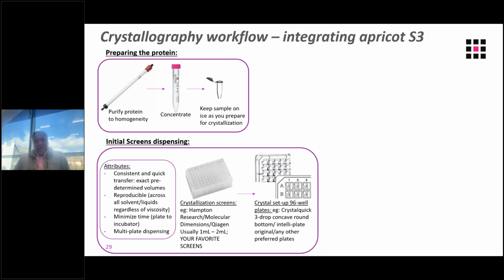And as Dr. Rees alluded to, some of the attributes we want are to make sure that our transfer from these 96 plate screens to the crystal setup 96 plate wells is very consistent and reproducible across all kinds of solvents and liquids, regardless of the viscosity.